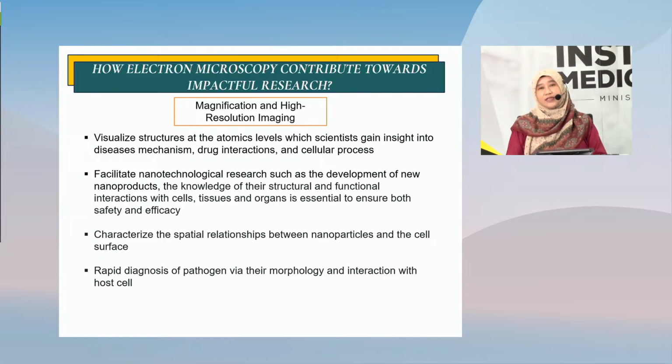The keywords in the answer are magnification and high resolution imaging, where these two characteristics are almost exclusive to EM technology.